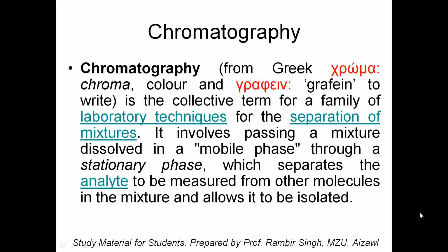So you have a huge, very complex mixture of biomolecules, and you cannot analyze that complex mixture by spectroscopy, because most spectroscopic techniques demand that we work with the pure compound, right? So you have to purify a compound. Purification of a compound is a great science, and if you are able to purify a compound, we can always use it for development of a marker compound.